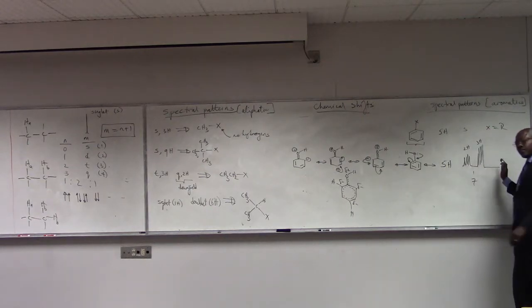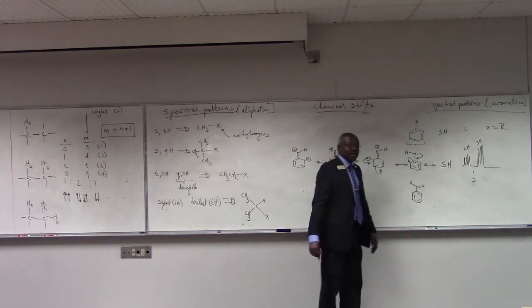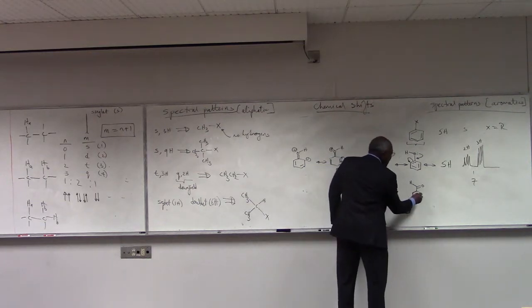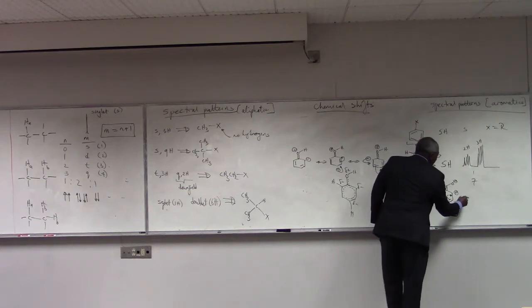On the other hand, if I have something like a carbonyl group, say I have benzaldehyde, the opposite thing happens. And I'll just draw one or two. I can draw a resonance form like this. And in this resonance form, the ortho and para carbons, and therefore the H's attached to them, are actually going to have a positive charge.